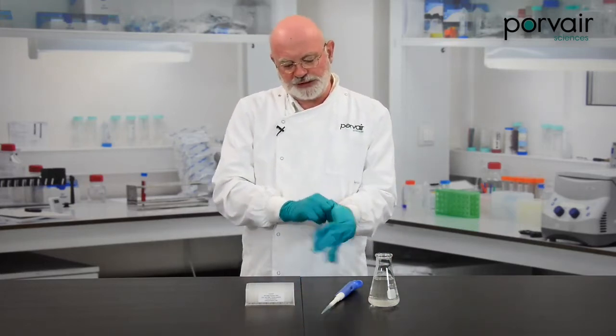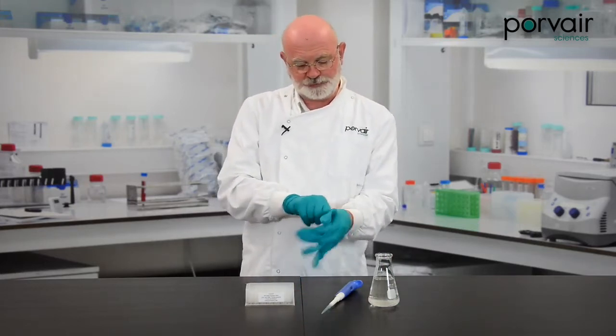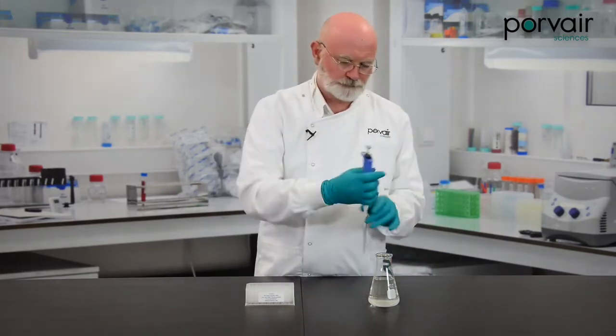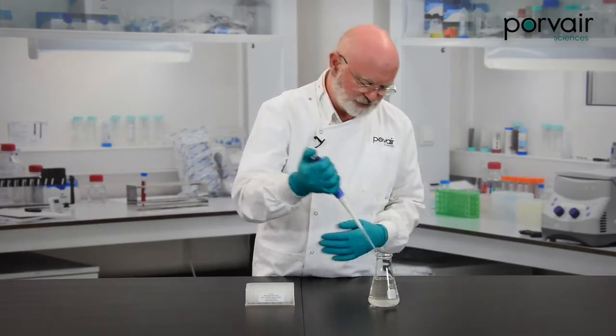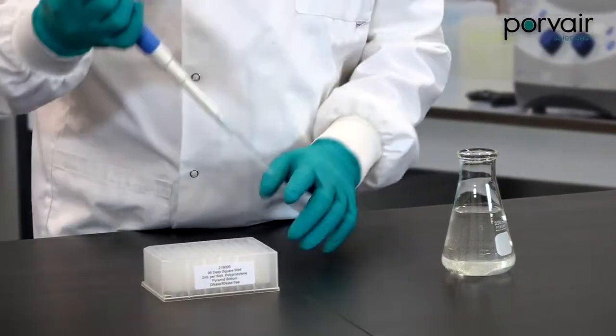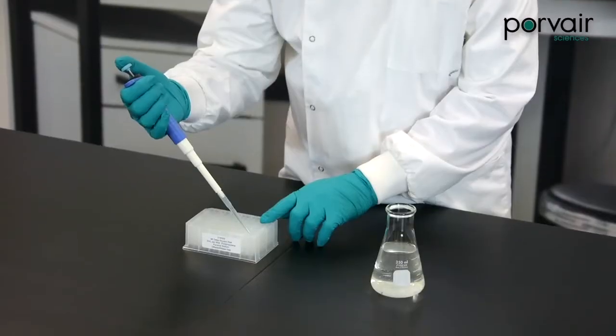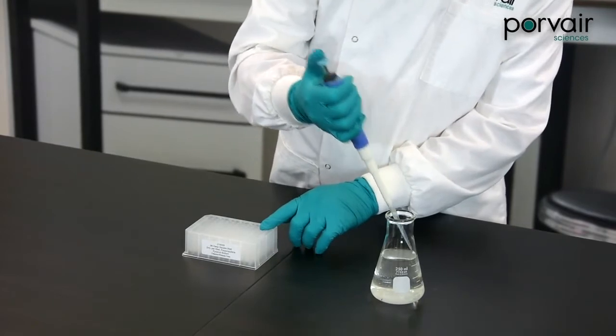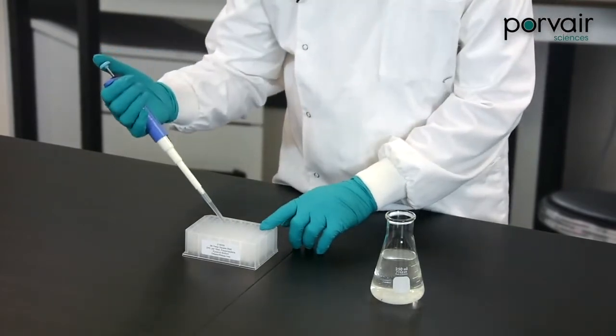We then leave the plate to stand overnight with the methanol in the well, and that gives anything which is going to extract or leach the chance to come out into solution where we can analyze it at a later date.